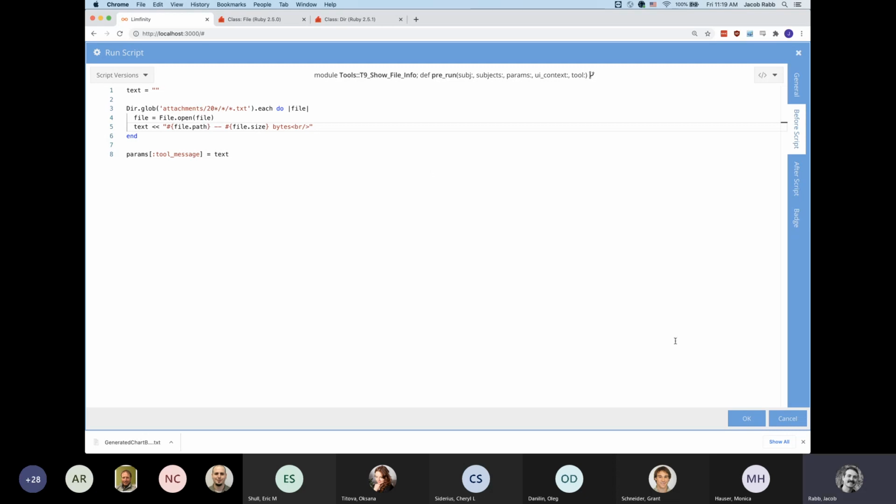All right. Any questions on this example before I close the code?